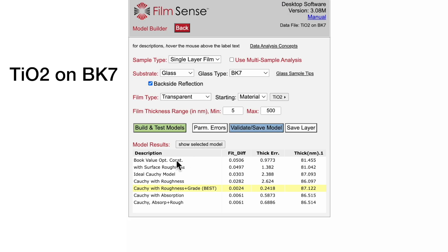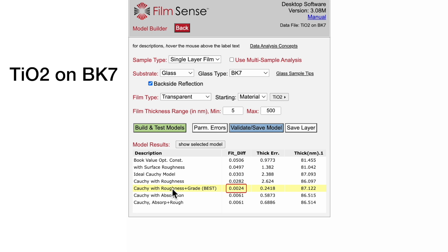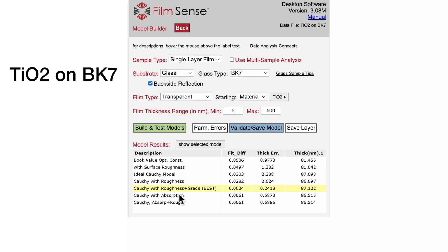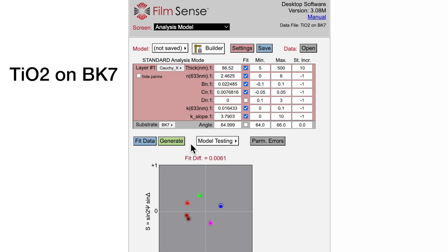Note that the simple book value optical constant model, the ideal Cauchy model, and the Cauchy with Roughness model do not fit the data acceptably, as their fit diff values are more than 10 times larger than the best model. The more complex Cauchy with Roughness model and grading is really required in this case, and it also fits the data better than models which included absorption in the film.